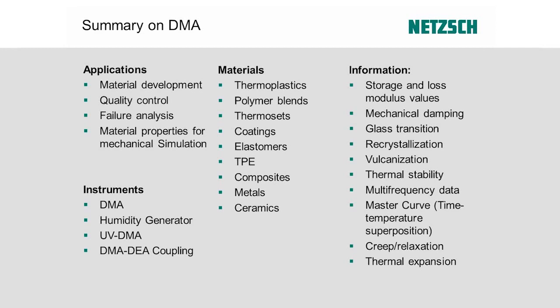There's more, which I could not talk about today. This is multi-frequency data as a function of the frequency, where you can derive master curves. You can look at static modes such as creep and relaxation. And in the end, you can also turn off your oscillation mode and look at thermal expansion in some respect.